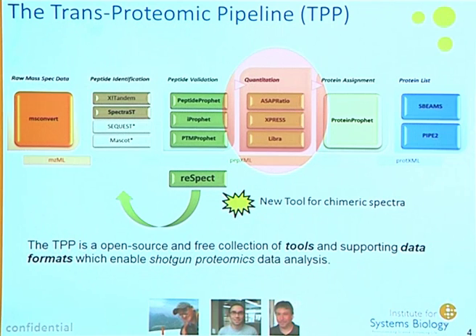But once you've got that, if you're doing labeled quantitation, either through SILAC, where you metabolically label your proteins from cell lines or other components. It could either be whole animals that have been fed with heavy labeled chow. They can be done that way. And there are even some experiments where I know humans have also been fed heavy labeled food, and they've done some experiments that way. There is a group, I know in San Diego in the US, that have had that approved for them to do that. Not that I would do that, but still.